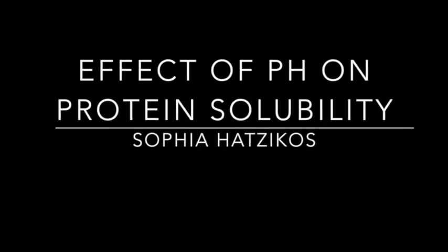Today's chemistry demo is on the effect that pH has on protein solubility. This is going to be demonstrated by adding HCl to a casein solution and reversing the reaction by adding NaOH. You're going to see how the pH and solubility are correlated by doing this.